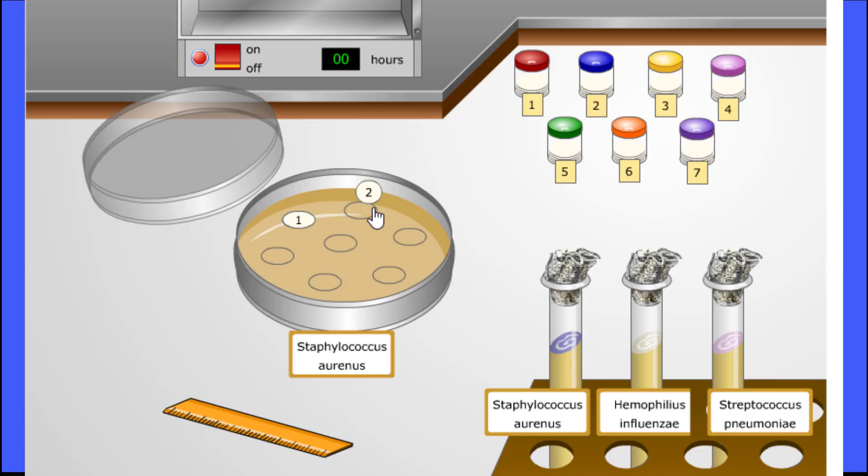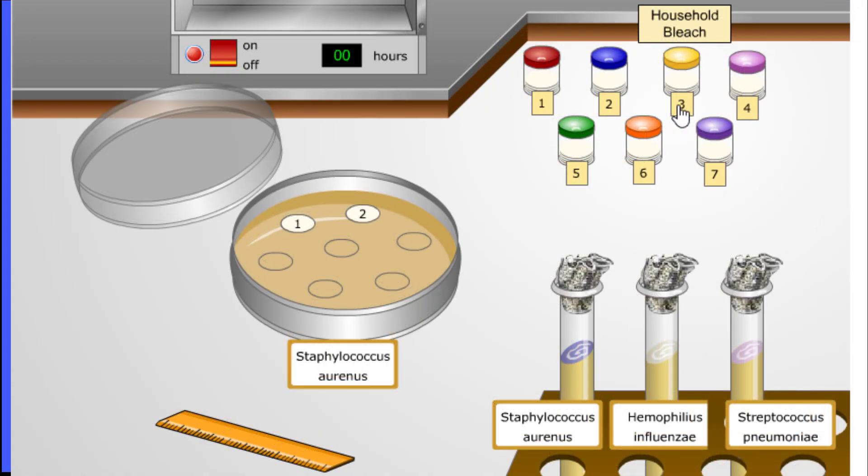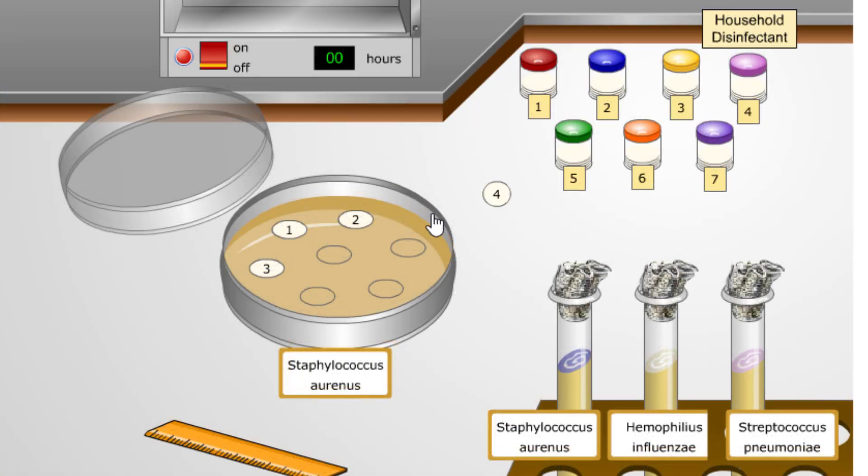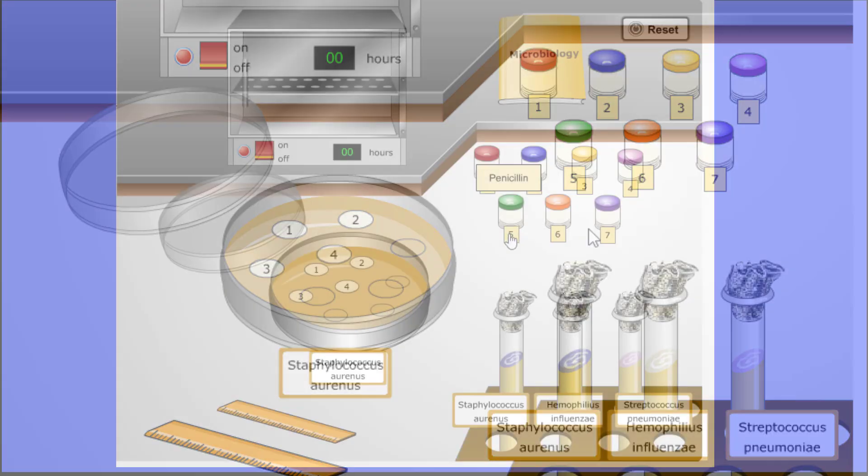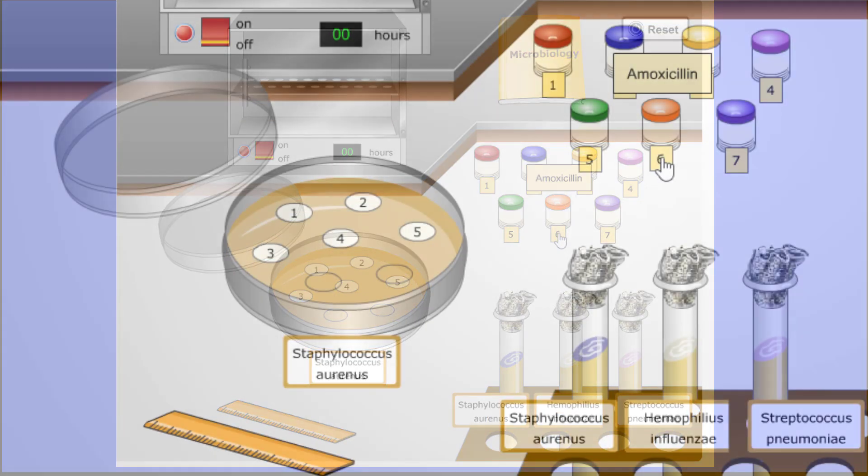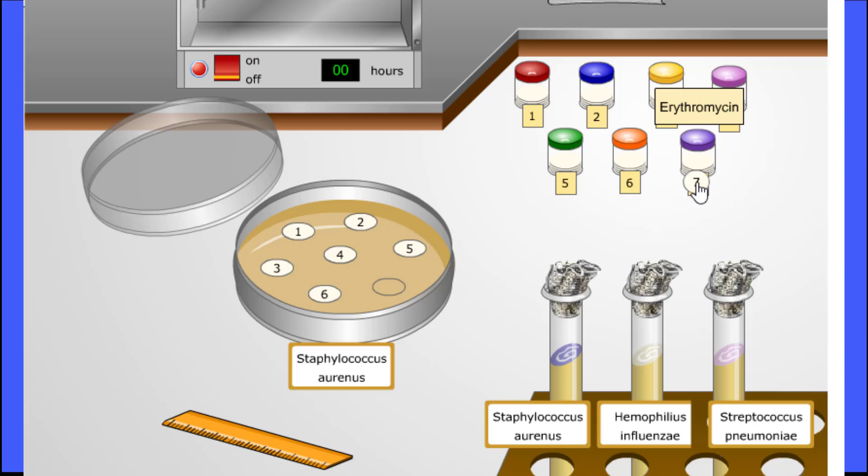Disc number 2 contains antibacterial soap. The disc from vial 3 contains household bleach. Disc 4 is going to contain household disinfectant. The disc from container 5 contains penicillin. The disc from container 6 will contain amoxicillin. And the disc from container number 7 will contain erythromycin.